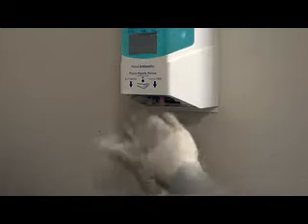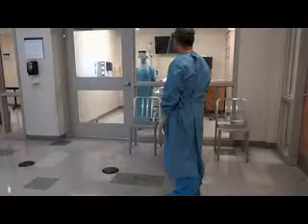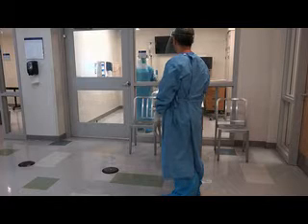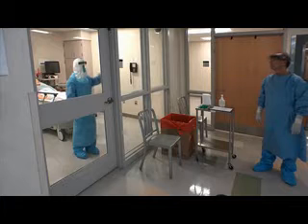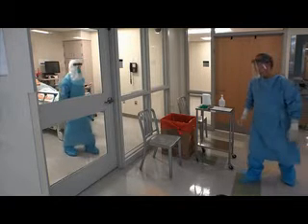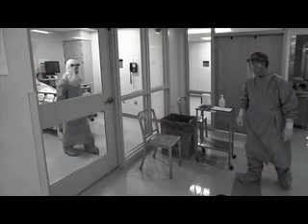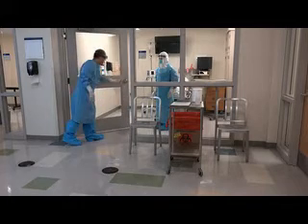Before leaving the patient's room, first use an EPA-registered disinfectant wipe to disinfect any visible contamination on your PPE. Disinfect your outer gloves with an alcohol-based hand rub and allow your gloves to dry. Ensure that a trained observer is available in the anteroom to supervise the PPE removal process using a checklist that remains in the anteroom and to watch meticulously for any breaching protocol. It is important for the trained observer to wear a fluid-resistant or impermeable gown, a full face shield, 2 pairs of gloves, and impermeable boot coverings. Enter the anteroom when indicated by your trained observer.